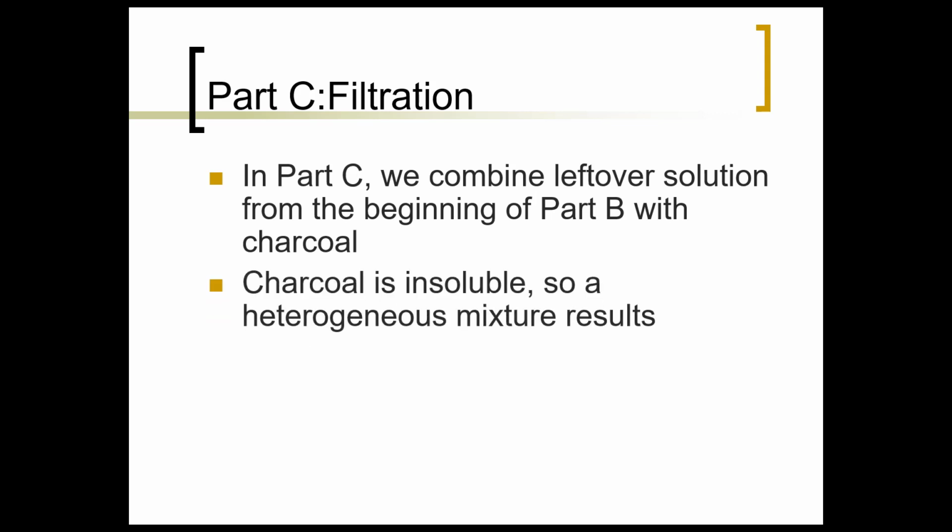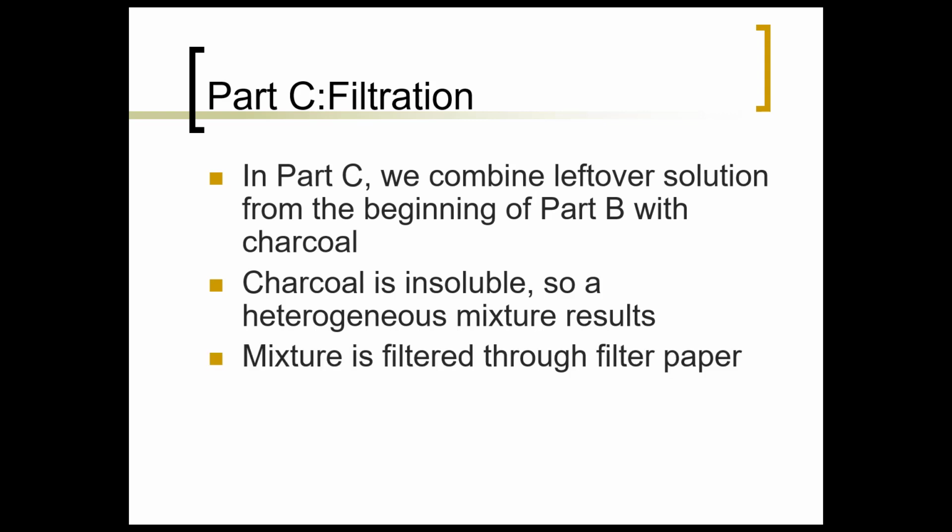Now, charcoal doesn't dissolve in water, so this produces a heterogeneous mixture. We will filter the mixture to see which solutes pass through. Now, this is similar in concept to Part B, with the filter paper essentially replacing the dialysis tubing.